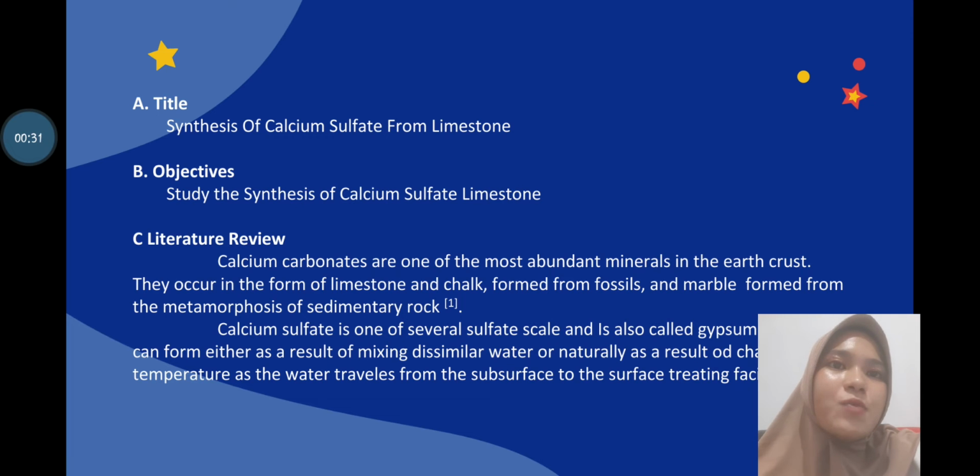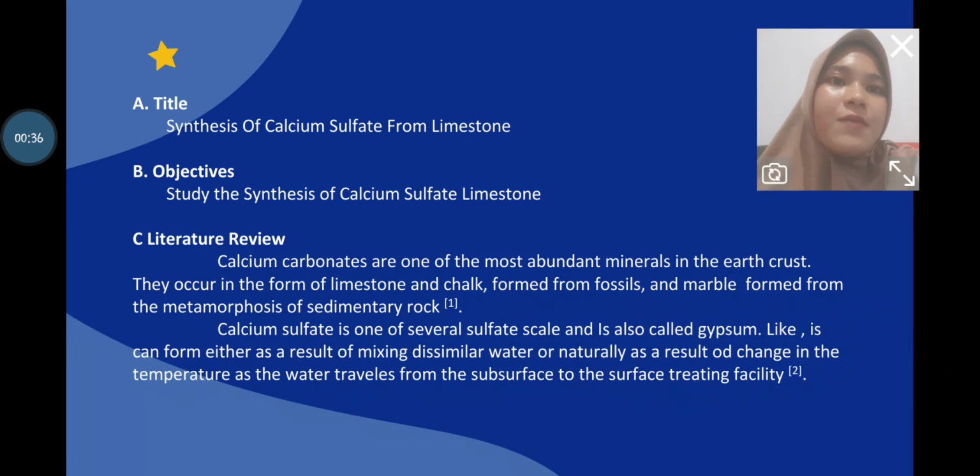Title: Synthesis of calcium sulfate from limestone. Objectives: study the synthesis of calcium sulfate from limestone.